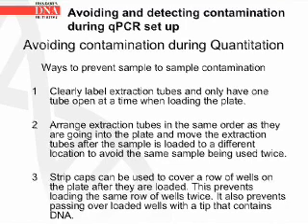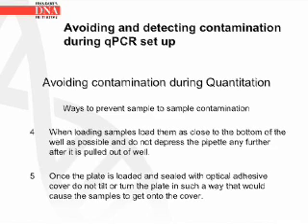Number 3. Strip caps can be used to cover a row of wells on the plate after they are loaded. This prevents loading the same row of wells twice. It also prevents passing over loaded wells with a tip that contains DNA. Number 4. When loading samples, load them as close to the bottom of the well as possible, and do not depress the pipette any further after it is pulled out of the well. And number 5.